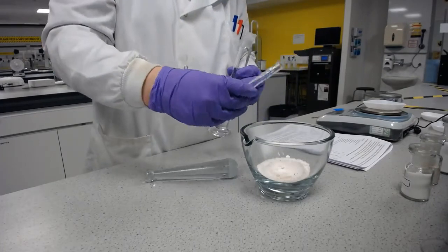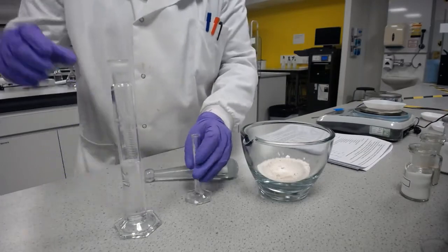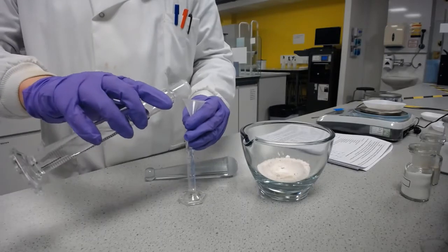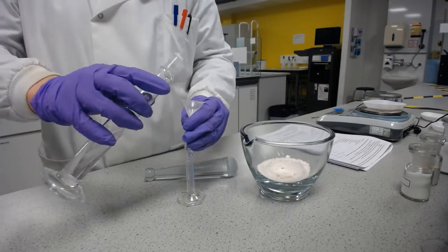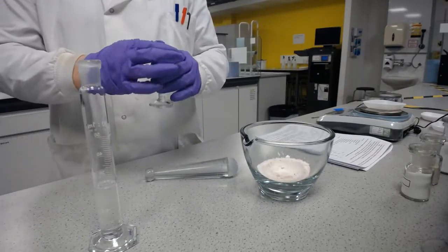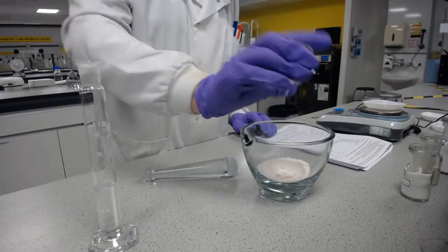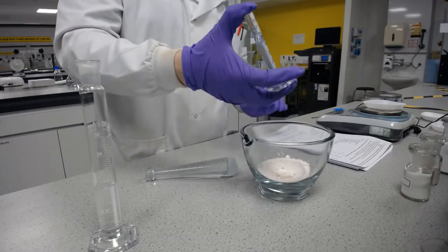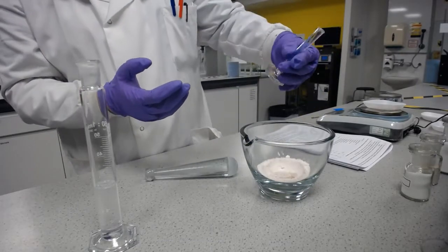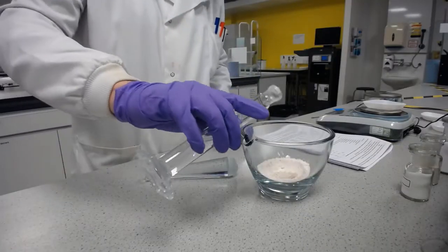It's dripping now and I'm starting to get a bit impatient with it. So what I'm going to do is, using a little funnel, pour some of this water I'm going to use in there. And I'm going to give it a little shake. So I'm going to reduce the viscosity of that glycerin so I can get that all nice and easily in. And I've emptied my measuring cylinder. Now let's put a little bit more water in.